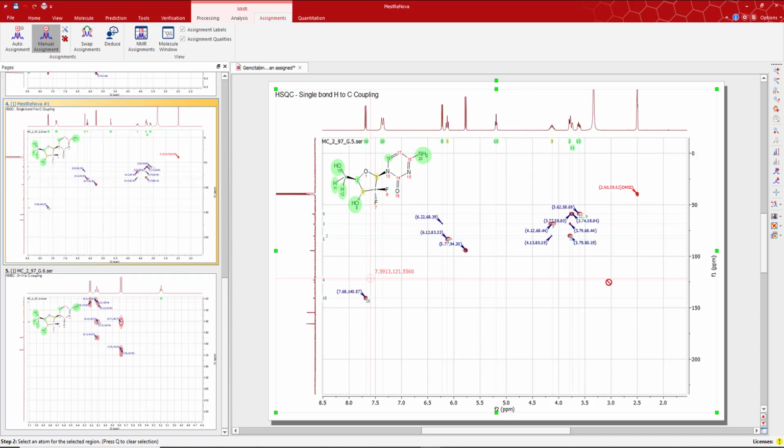So I could go digging into a COSY to figure out what proton and carbon number 17 is. Well, I could go into the COSY and figure that out definitively, but also I only have 1 proton signal left that I haven't assigned yet.